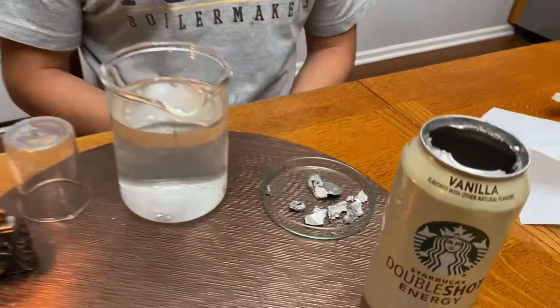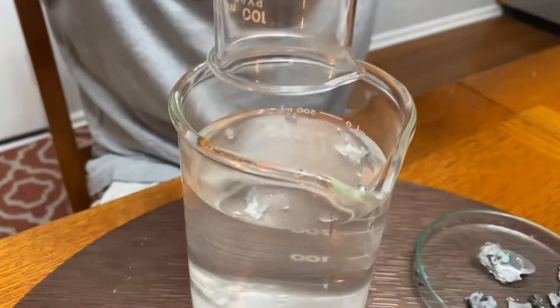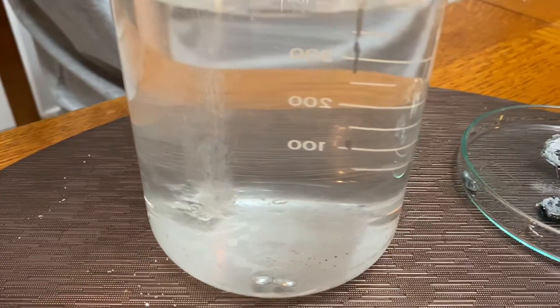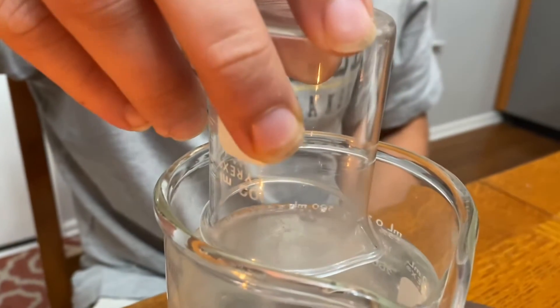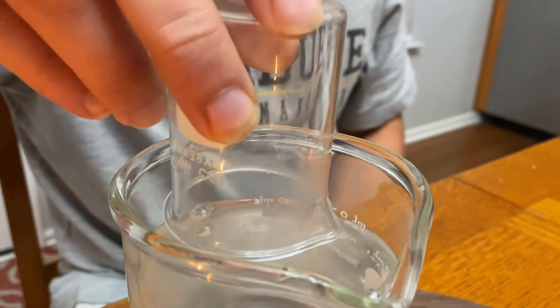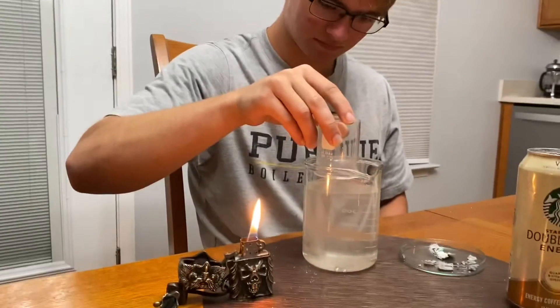Now we're ready to test the chemical change of this aluminum-gallium alloy. Alex is just going to put these chunks of aluminum gallium in water and it's going to react and release hydrogen gas. Do you see those bubbles coming up? That's the aluminum reacting with the oxygen in the water, releasing hydrogen gas. Alex is capturing that hydrogen gas in this little beaker that he has inverted over the bubbles. When he thinks there's enough hydrogen gas in there, he's just going to very carefully lower the beaker over this open flame, and that hydrogen should ignite.